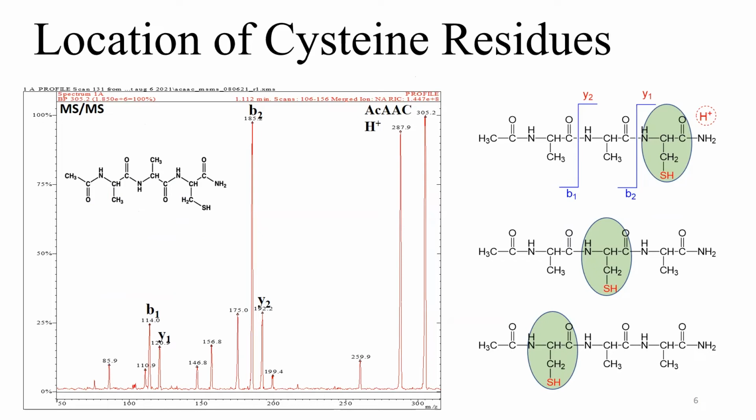If you're looking at B1, for example, it is considering everything to the left. So the fragmentation patterns are going to be the mass-to-charge ratio of everything to the left. Therefore the peaks are going to reflect the specific peptide.